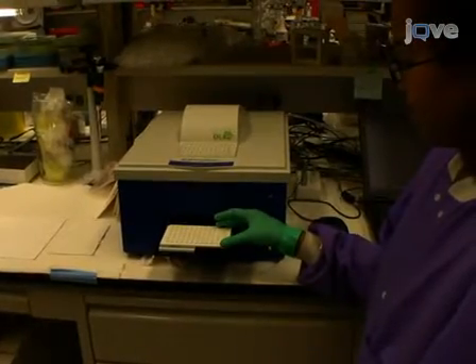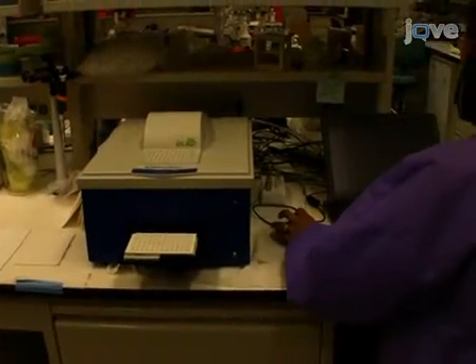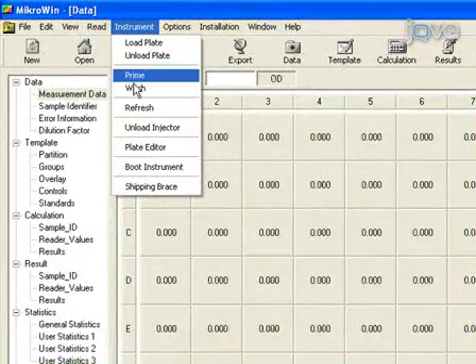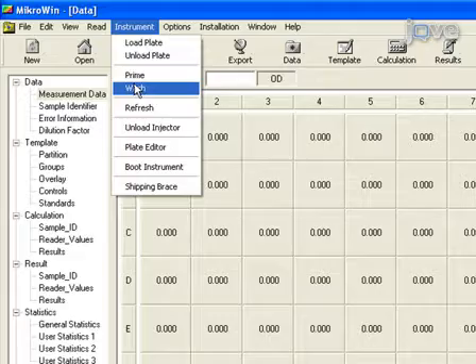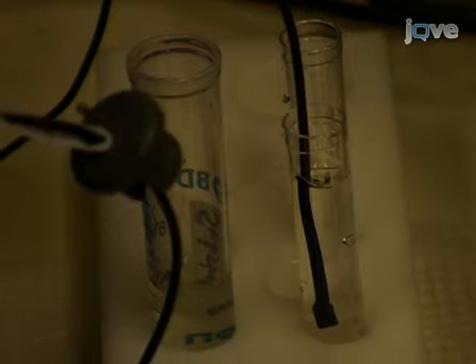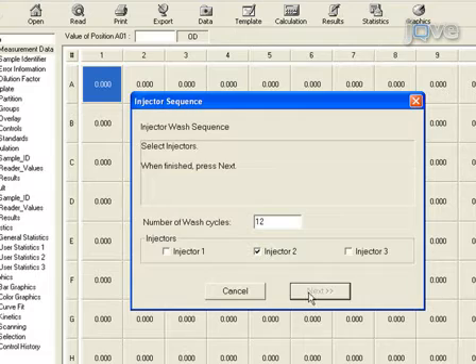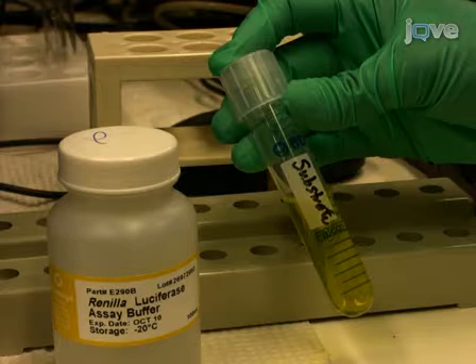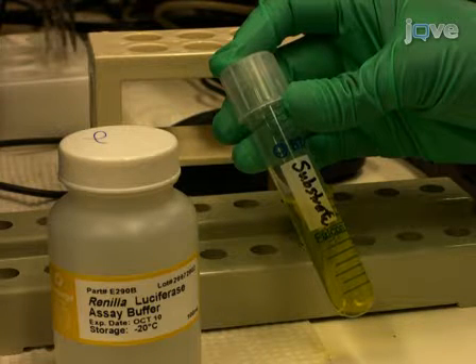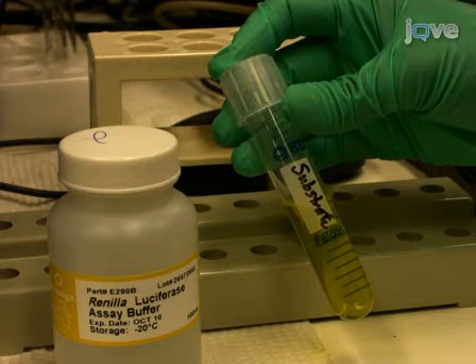A Berthold LB 960 Centro Microplate Luminometer is used for determining luminescence in each well of the plate. Turn the machine on and rinse the injector with distilled water using the injector wash cycle. Coelenterazine substrate is used for priming and running the machine and is prepared using the Promega Renilla Substrate Kit following manufacturer's instructions.